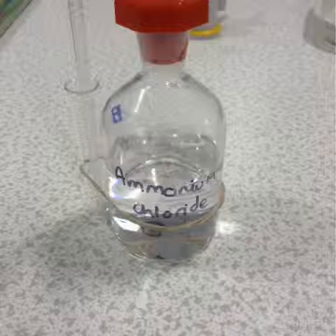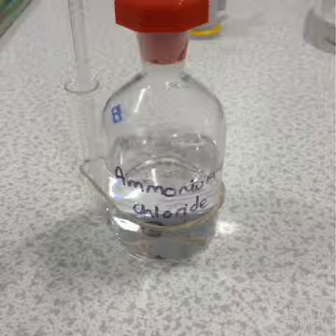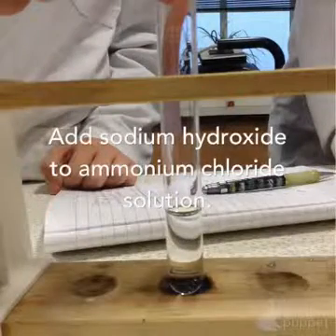For this experiment we are going to use ammonium chloride as our source of ammonium ions. We are going to start off by pouring a small amount of ammonium chloride solution into a test tube and add one pipette of sodium hydroxide.